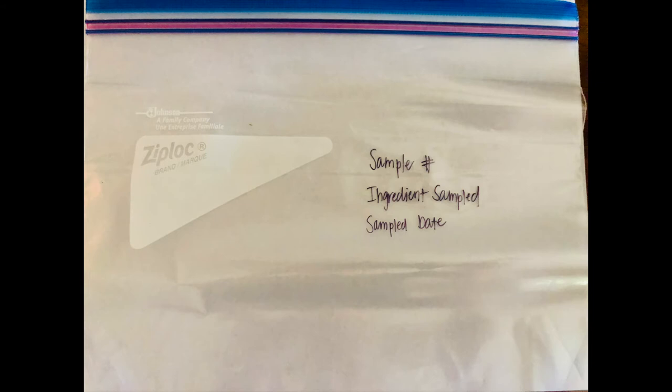Once you have collected 10 samples from the stream of either feed ingredient or complete feed, be sure to seal the plastic bag containing all 10 feed samples and, with your permanent marker, label the bag with the sample number, what was sampled, and the date that the sample was taken. This sample is now ready to be logged and submitted for laboratory analysis.